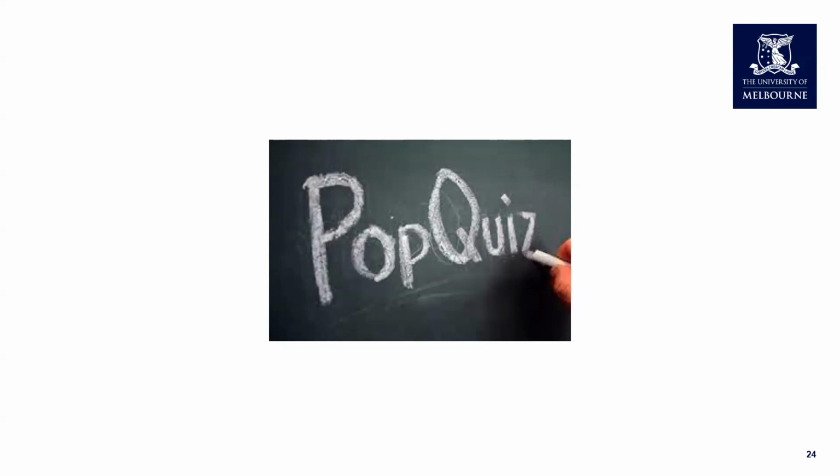And the second question is which bit depth should you use for intensity measurements? Here the majority of people answered correctly, 16 bit depth, but some people also selected 8 bit depth. As I mentioned, the higher the bit depth the better for separating subtle differences of intensity. So it's always good to use a higher bit depth, whatever is available on your acquisition system.